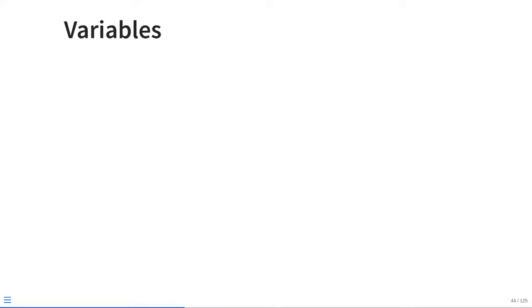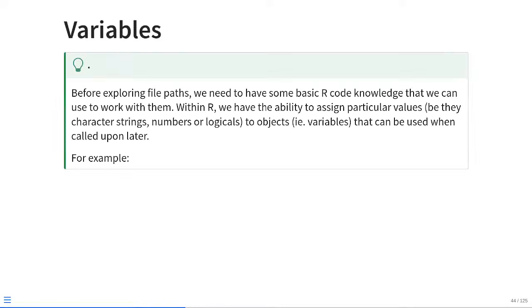However, before we do so, we should talk a little bit about some basic R objects. Basically, how do we create a particular object or a particular variable?